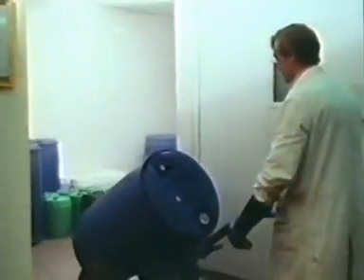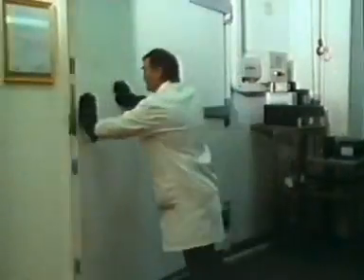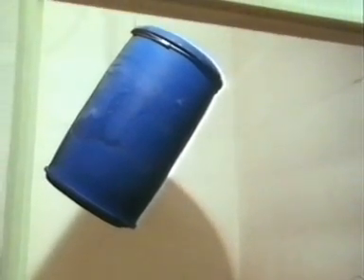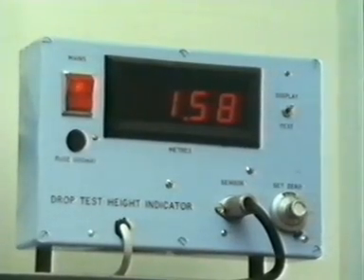This polyethylene barrel, filled with antifreeze solution, has been stored at -18 degrees C. Has it become brittle? Here's one kind of test. It's dropped onto a rigid surface.